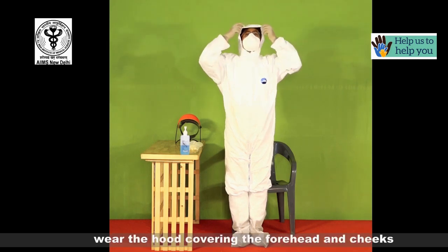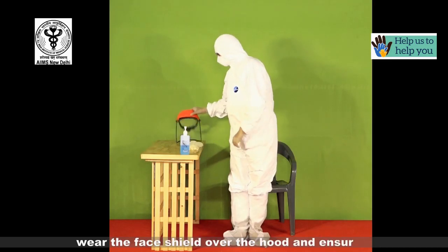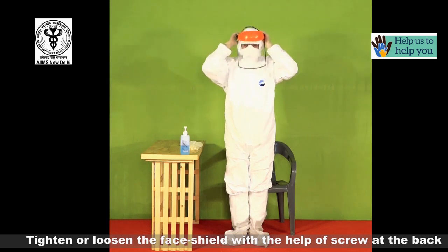Now wear the hood covering the forehead and the cheeks. Wear the face shield over the hood and ensure the fit. Tighten or loosen the face shield with the help of the screw at the back.